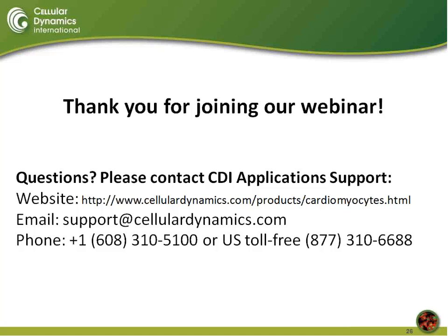And we have another question asking, can these cells be put back into suspension after several days of plating for automated patch clamp? This is something that we are not working on internally, but we do have collaborators working on this process. And as that data comes back and protocols are developed, we would certainly be able to provide information. But at this time, we have not done that internally.